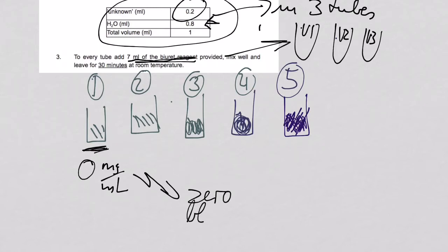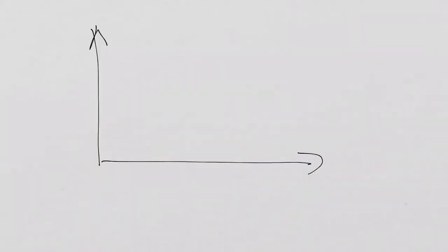Or blank the spec. Yeah? And then you just simply put in your samples and simply measure the absorbance.